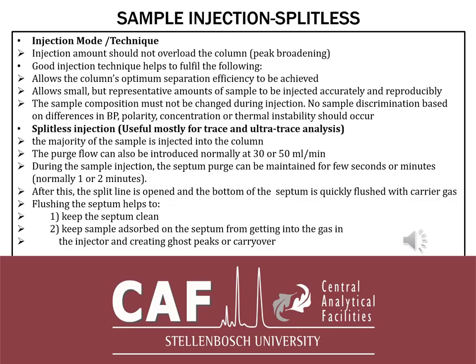And the other thing with splitless, as I said, if you're working in PPTs and lower PPBs, splitless injection will work much better. Some people ask, but how do I differentiate between a split and a splitless? It is simple. In a case where your peak was very, very minute, very, very small, if you're doing split and you start doing splitless, you can enhance that peak.